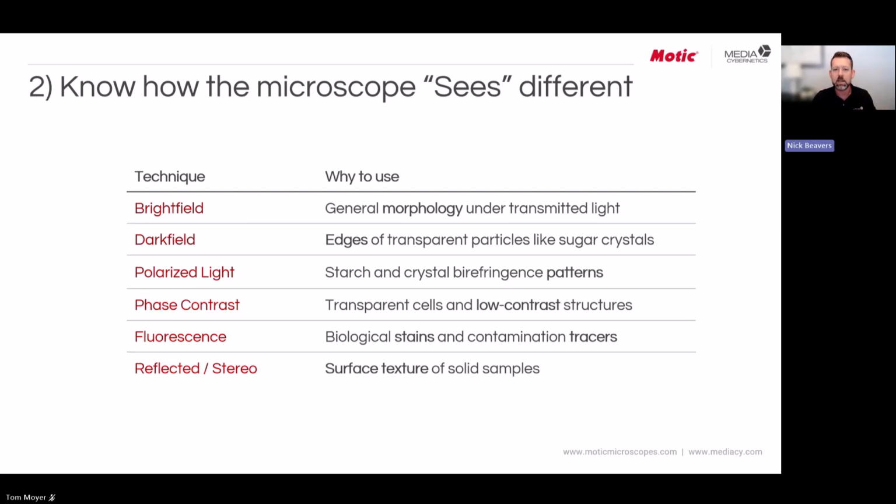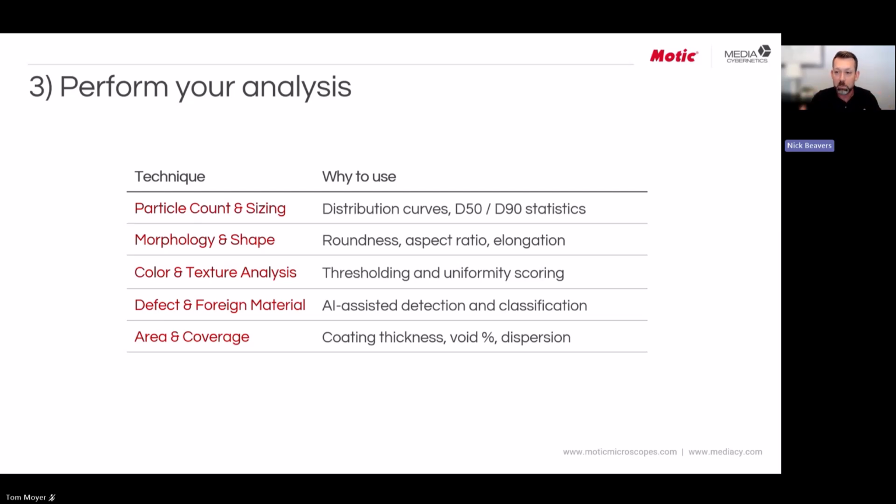So keep those in mind as number two: I want whatever is in my image to have as good contrast as possible. I want it to be easier to find what it is I'm looking at, even just with the naked eye, but I'm also trying to make that easier for the software as well. And so I have established what I want. I've chosen my method of microscopy.